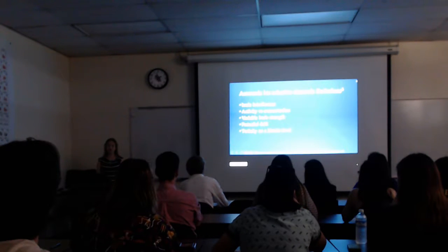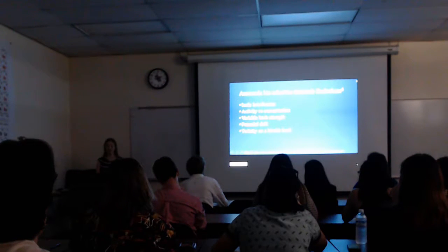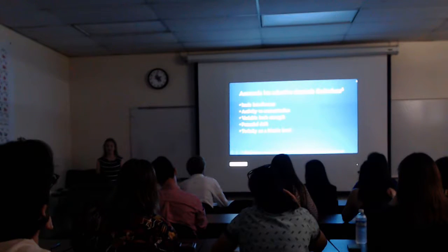There is also an issue with concentration versus activity. A higher concentration produces a lower activity. Then there's variable ionic strength, the potential drift that's associated with all electrodes. And the ammonia gas electrode is twitchy on a kinetic level.